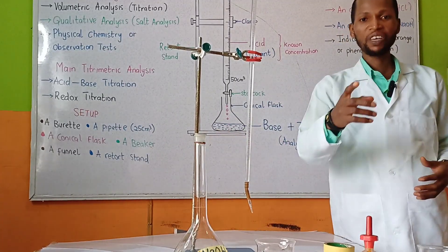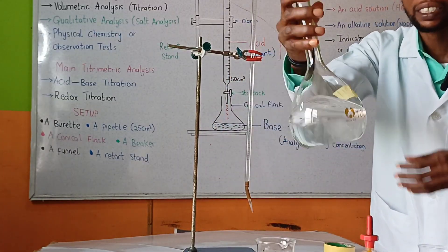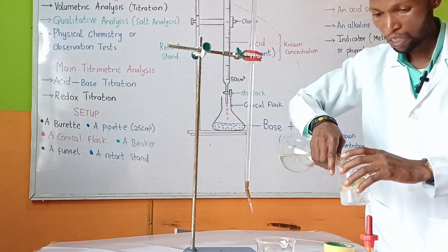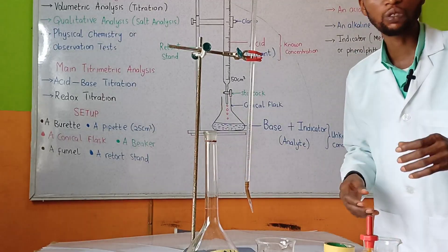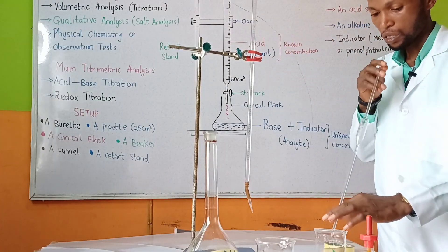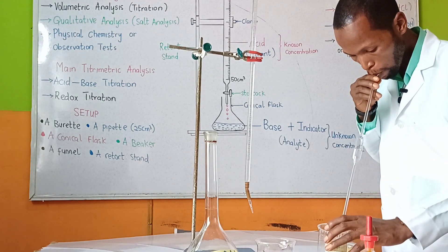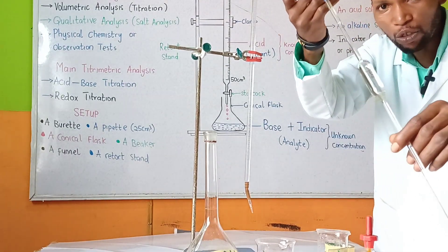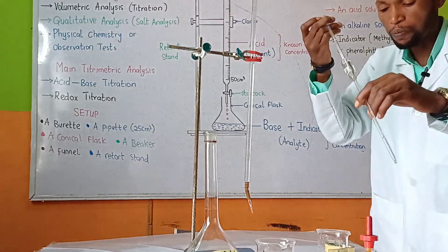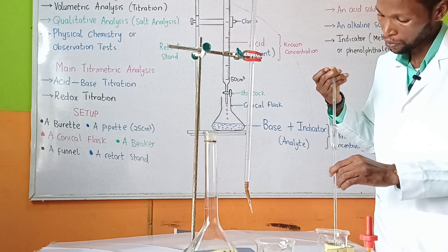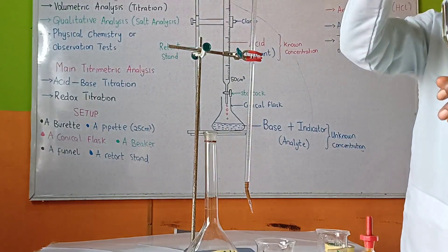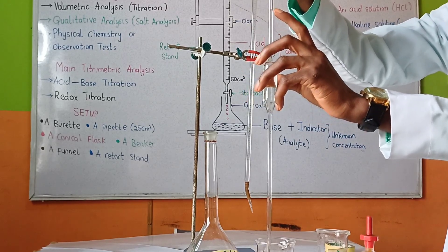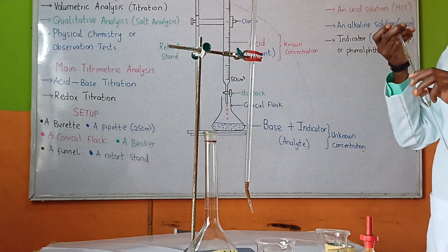In this standard volumetric flask I have my sodium hydroxide. I'm going to introduce it into the beaker and then pipette the solution of our base using our pipette. I will ensure that it is at exactly the 25 mL or 25 cm³ mark — reading at the meniscus. That's 25 mL or 25 cm³ for the pipette.